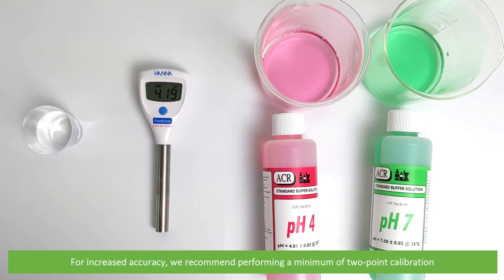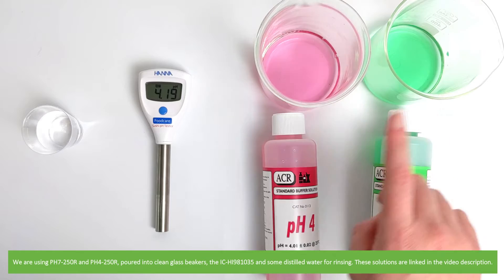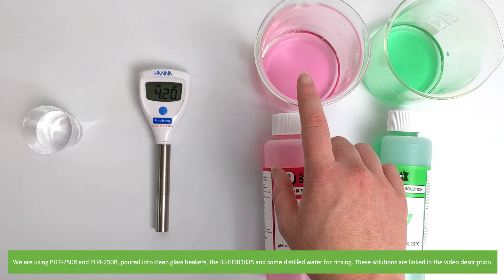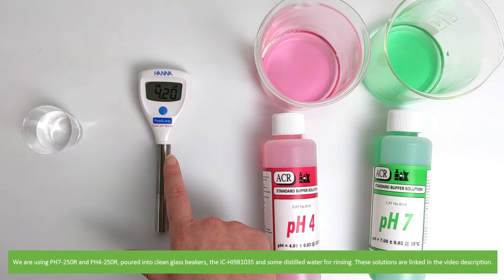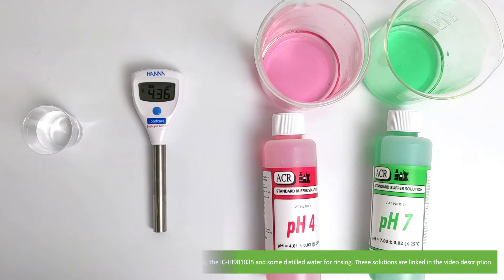For increased accuracy we recommend performing a minimum of a two-point calibration. For this calibration we are calibrating to PH4 and PH7. We are using PH7250R and PH4250R poured into two clean glass beakers, the ICHI 981035 and some distilled water for rinsing. These solutions are linked in the video description.